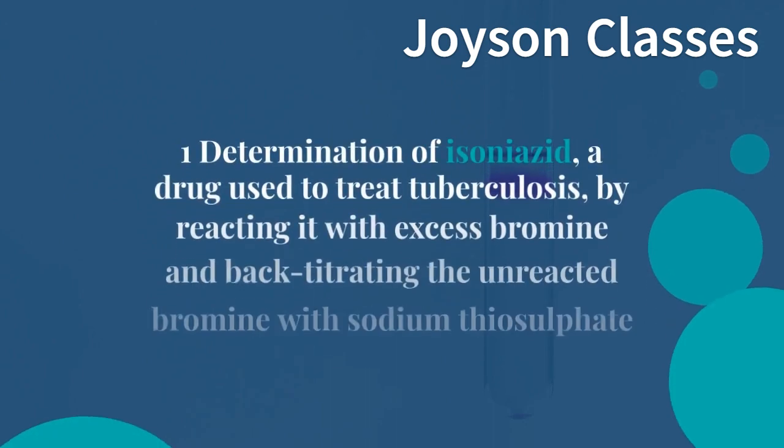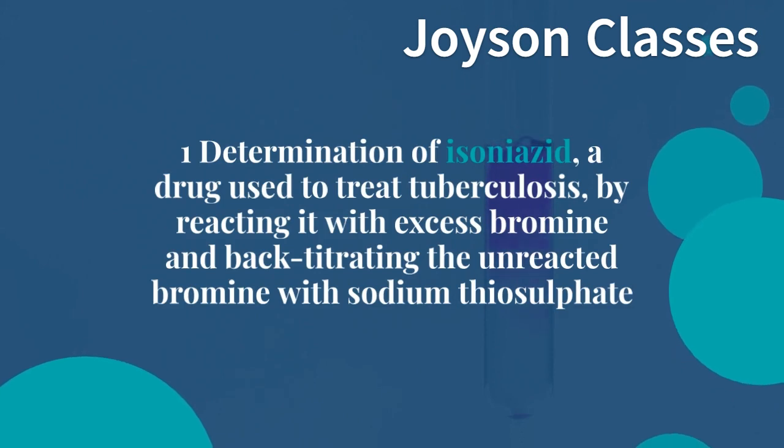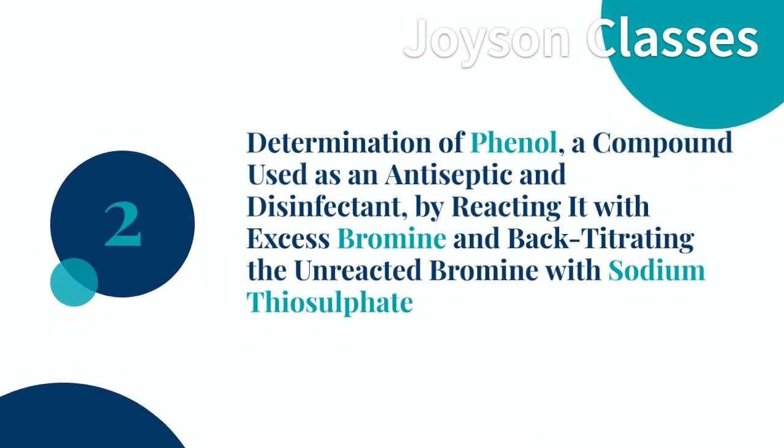1. Determination of isoniazid, a drug used to treat tuberculosis, by reacting it with excess bromine and back-titrating the unreacted bromine with sodium thiosulphate. 2. Determination of phenol, a compound used as an antiseptic and disinfectant, by reacting it with excess bromine and back-titrating the unreacted bromine with sodium thiosulphate.